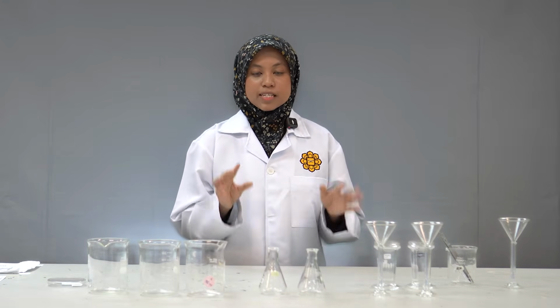This technique is not only used in laboratories academically, but also in pharmaceutical analysis for identifying unknown compounds efficiently. The problem statement that we used for this experiment is, by applying the thin layer chromatography principle, how is the calculated retention factor or Rf value used to determine the identity of a compound that we want to know.